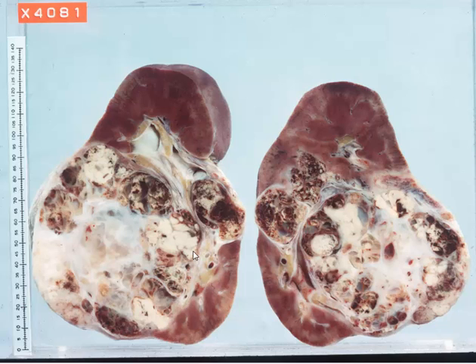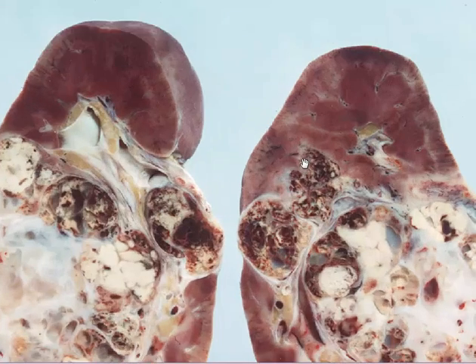This mass, you've got to ask yourself, is this a neoplasm or is it a hyperplastic response? And clearly the destructive nature and the size of this and the focal nature of this mass is strongly suggestive that it's a neoplasm. And if you think that, then the next question is, is this a benign or a malignant neoplasm? You might remember that the pathological hallmark of malignancy is tissue invasion, and pretty evidently in this specimen the mass is invading and destroying renal parenchyma.